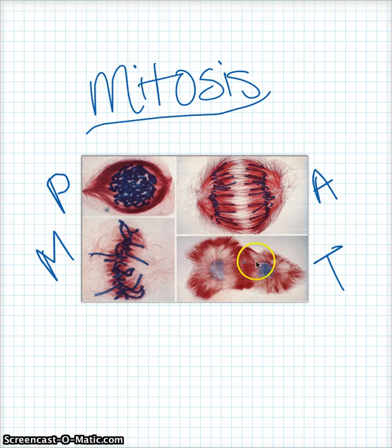But you can tell that they're two separate nuclei, and the spindle fibers are starting to go back to a little bit less visible. So, again, this picture is super easy to tell what's going on. So, let's try some more difficult ones.